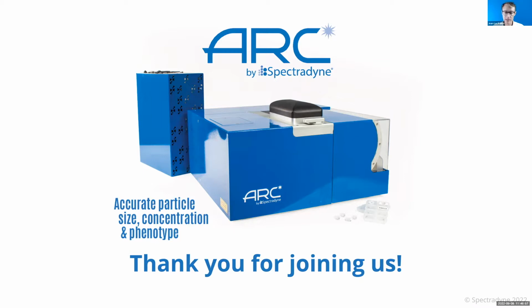Lou, do you see any other questions in here that we should get at? Yeah, there's one here from Michael Evender. It says, I guess you are using traditional cytometry fluorophores. Have you looked into anything into how to avoid counting fluorophore/antibody aggregates as fluorescent positive vesicles? This has been a big issue for us with fluorescence techniques for vesicles before and after filtration.